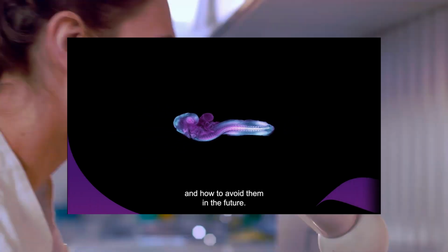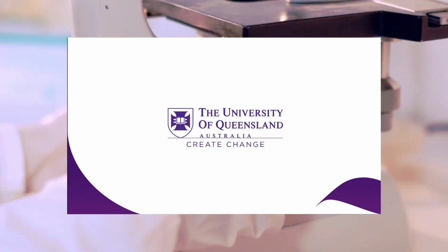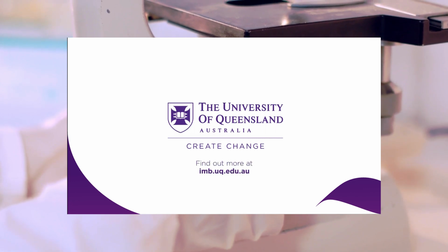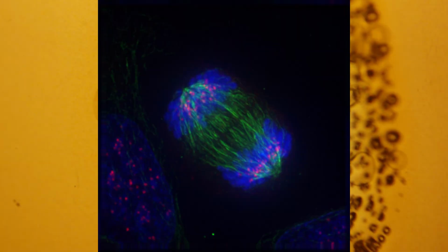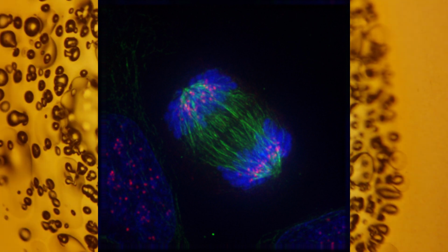And then finally we have the issue around the technique itself. One of the major challenges, at least until relatively recently, and certainly in a broader sense, is that you can only look at specific things. That's oftentimes because what you're trying to do is use one fluorophore, although you can sometimes use multiple, to stain a single structure.